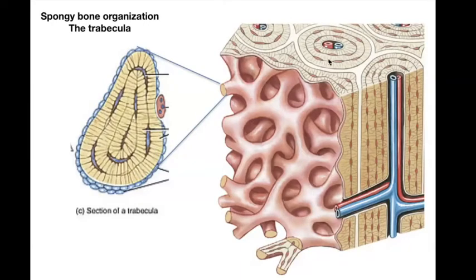Right? And the osteon was the functional unit of the compact bone. And then on the inside of your bone, remember, you had that porous or cancellous or spongy bone, right? But when you look at it closely, if you take a cross section of one of these, what are called trabecula over here, you'd see the osteocytes in the lacuna. You'd have the little canaliculi, that are these little lines right here. And in this case, you could see here's the osteocytes.